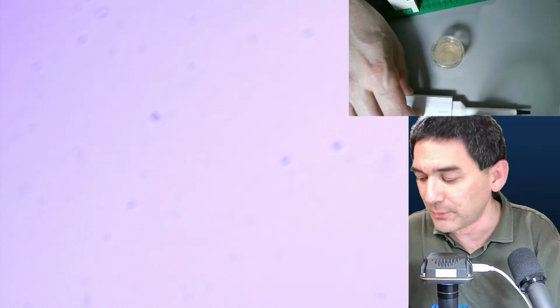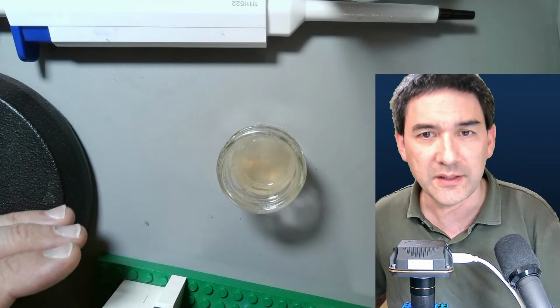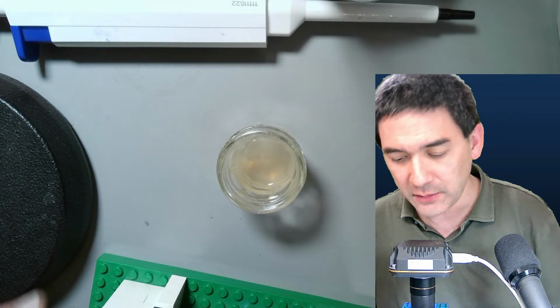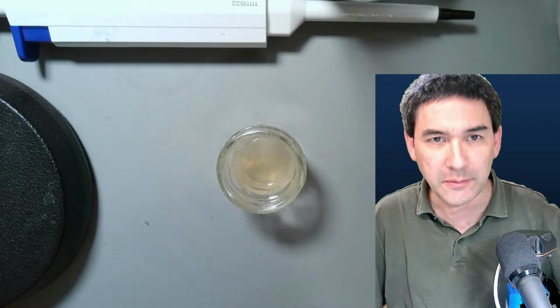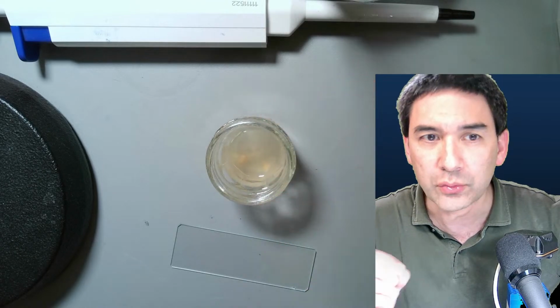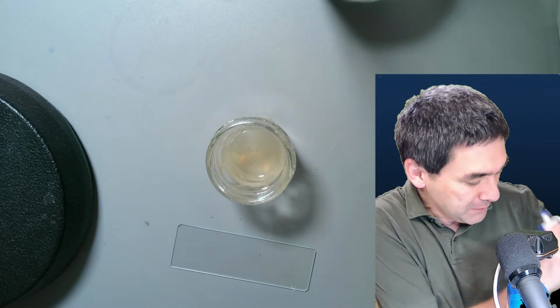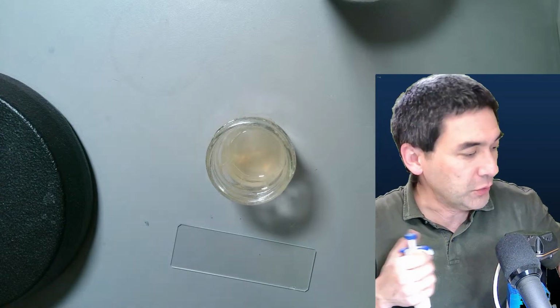Now, these are probably pretty difficult to observe because they don't have a color. But you know what I'm going to do now is I'm going to just show you a little bit here. Now it's a little bit smaller. Maybe I can change it, let's do it like this. I'm going to move the Lego microscope a little bit out of the way. What I've got here is some pond water, and I added a little wheat grain, and I left it to rot for a week or so. There are a few ciliates in there indeed, but not paramecium, unfortunately. Smaller ones.